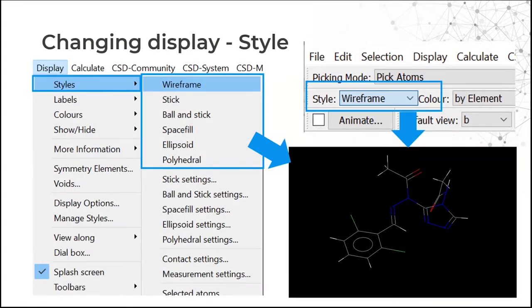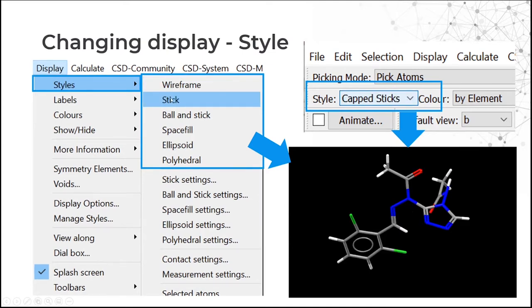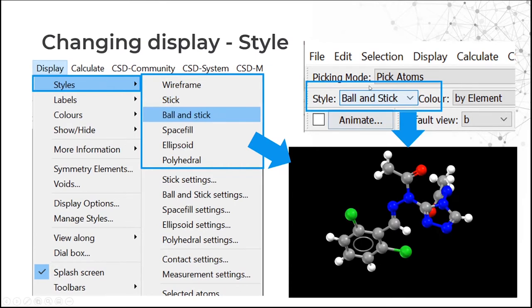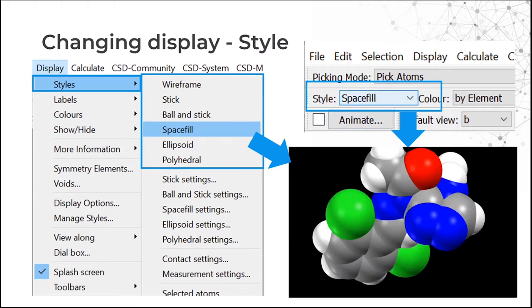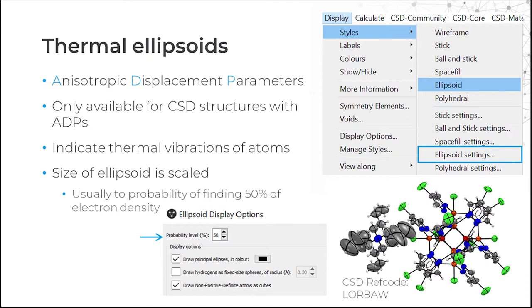There are a number of different display options in Mercury. To see these, go to the Display menu and then Style. You can select wireframe, or use the Style dropdown in the toolbar. Other style options include capped sticks, ball and stick, and space fill. There is also an ellipsoid option, which shows the anisotropic displacement parameters — these are available for CSD structures or your own structures with ADPs, and they indicate the thermal vibrations of the atom. They typically appear as rugby ball shapes.